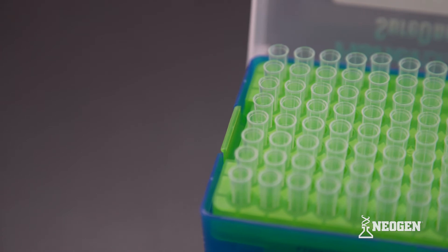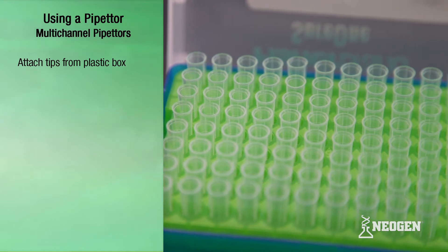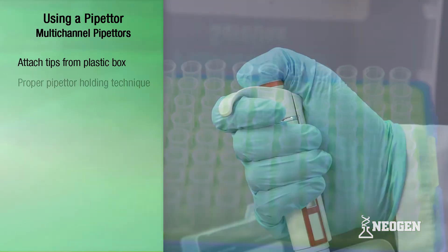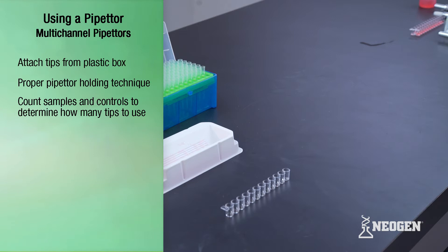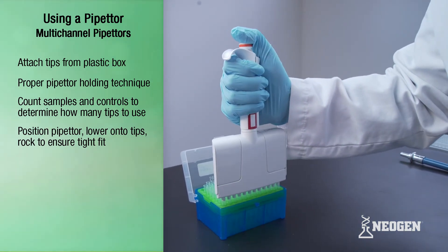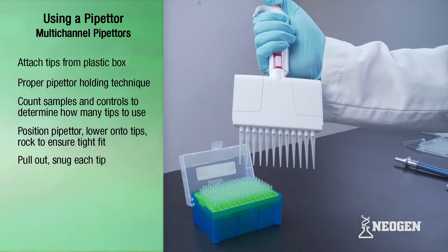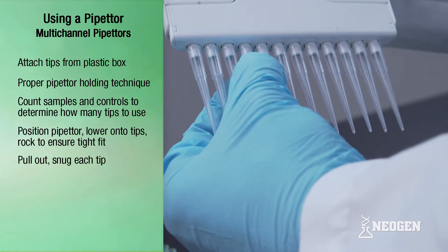The first step is to attach plastic tips to the end of the pipetter. Neogen recommends using plastic tip boxes where tips are placed upright into a box instead of attaching by hand. Attach the tips by holding the pipetter with your hand so that the thumb is on top and the fingers face outward. Determine the number of tips to attach by counting the number of controls and samples. Position the pipetter over the number of tips required and lower down into the tips, gently rocking the pipetter from side to side to ensure a tight fit. After attaching tips, pull the pipetter out and snug each tip by pushing the upper part of the tip onto the pipetter nozzle by hand.